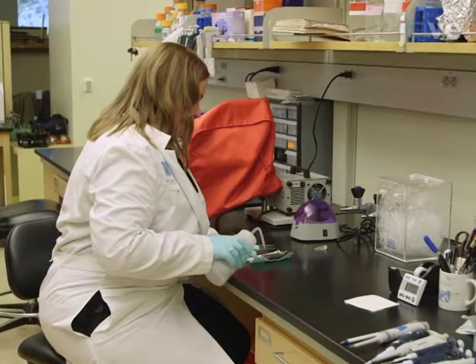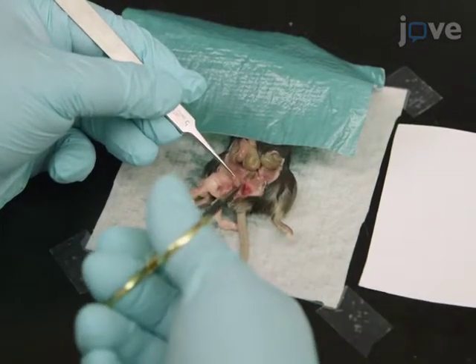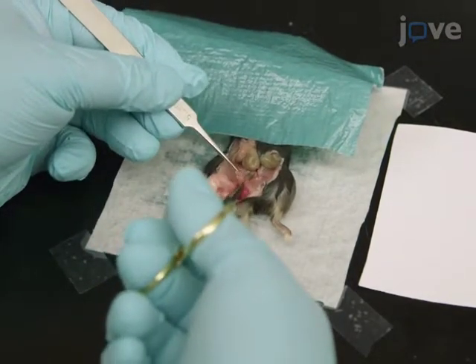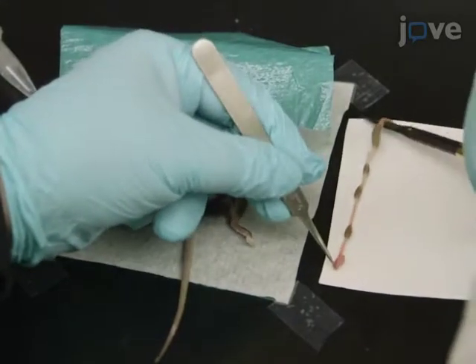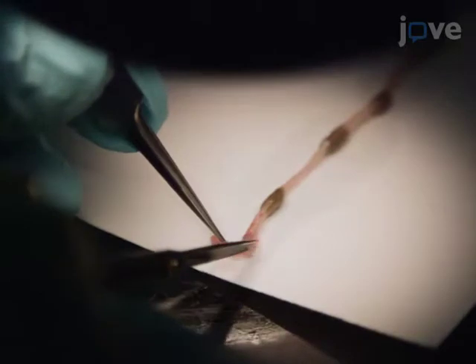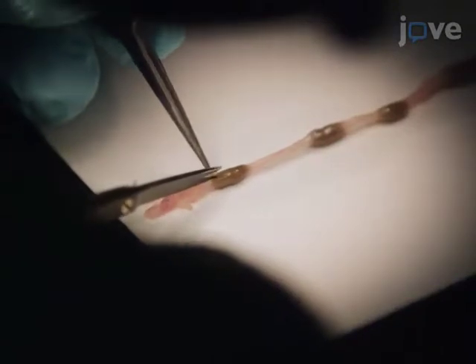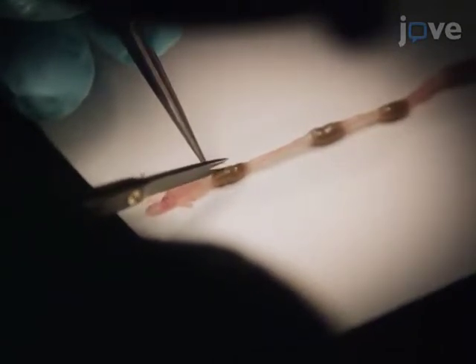To collect stool from a euthanized animal, dissect it to access the colon. Then, cut the colon just below the cecum and lay the colon out on a piece of filter paper. Then, use forceps to lift the top of the colon tube and open the lumen using scissors. Cut longitudinally, distal to proximal, to splay open the colon lengthwise.